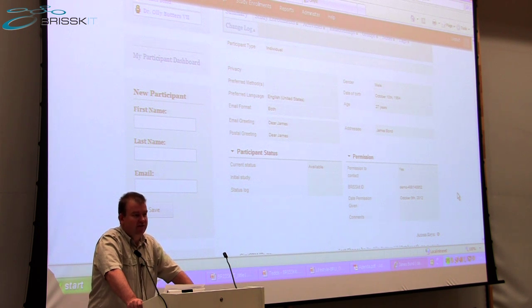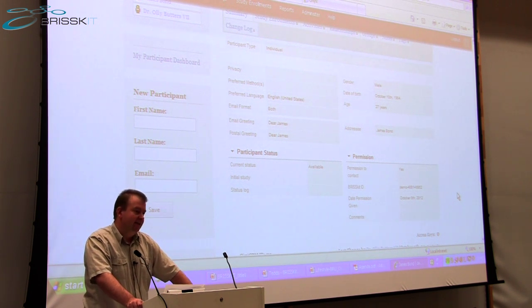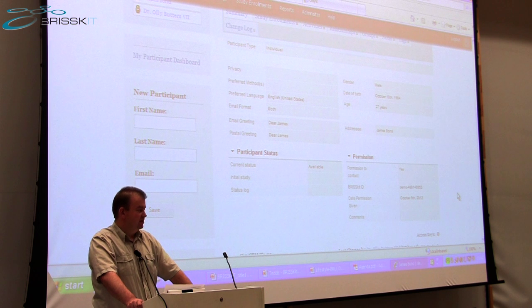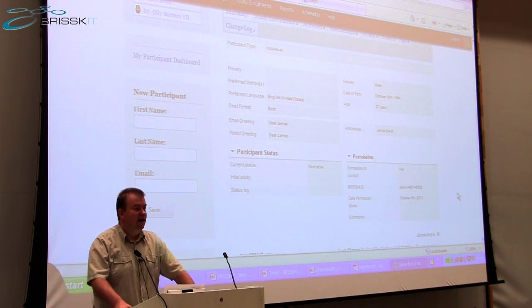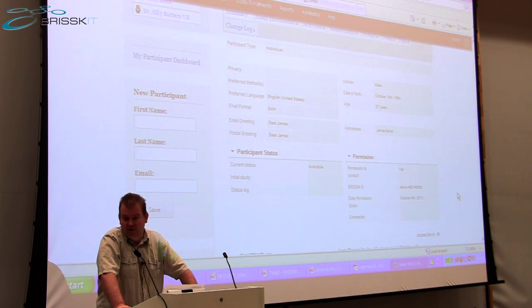So when the bloods arrive in our pathology lab and are scanned in to confirm arrival on the hospital site, that populates a database, and from that database the BRU admin staff can confirm receipt of the samples and thus automatically generate a participant record within Civi CRM. So part of the point of putting Civi at the front of the BRISSKit toolkit is the very flexible way that it enables you to interface with provider IT systems.